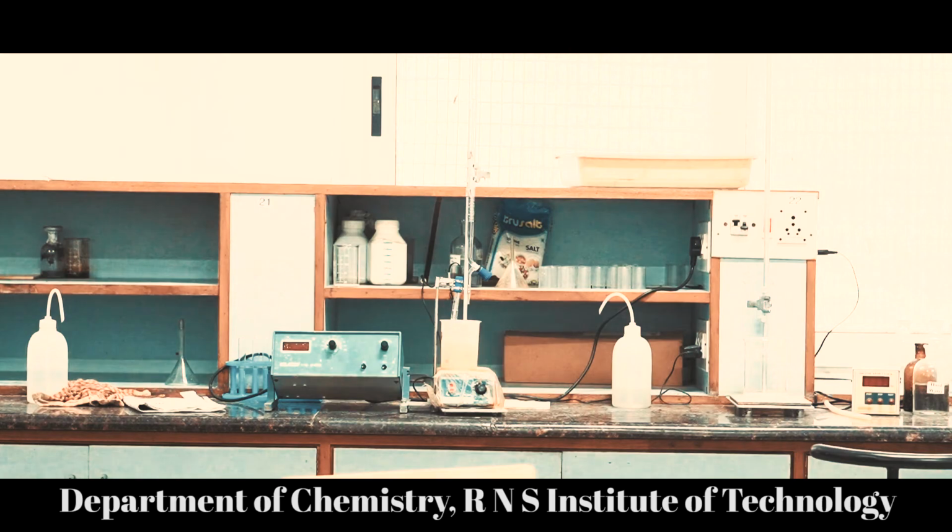Flask number 4, 0.24. Flask number 6, 0.36. Flask number 8, 0.46. Flask number 10, 0.54. Join all the points passing through the origin.